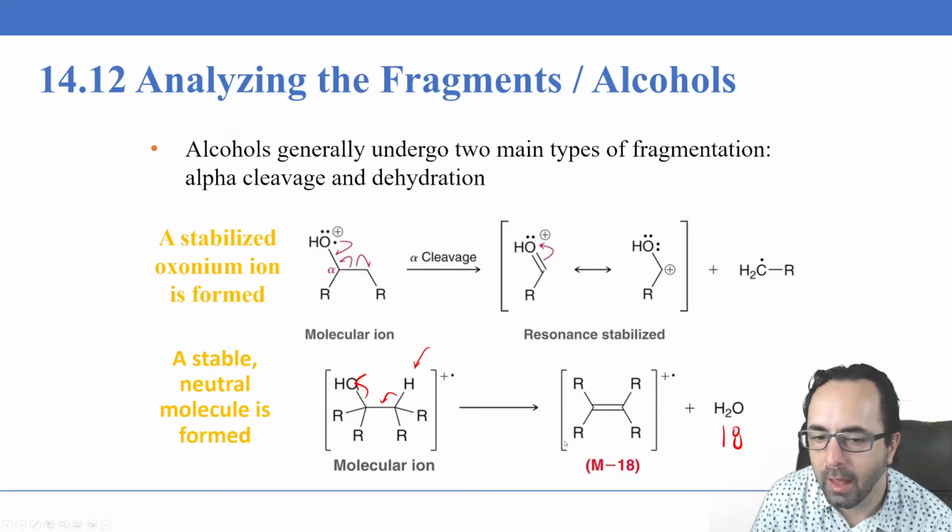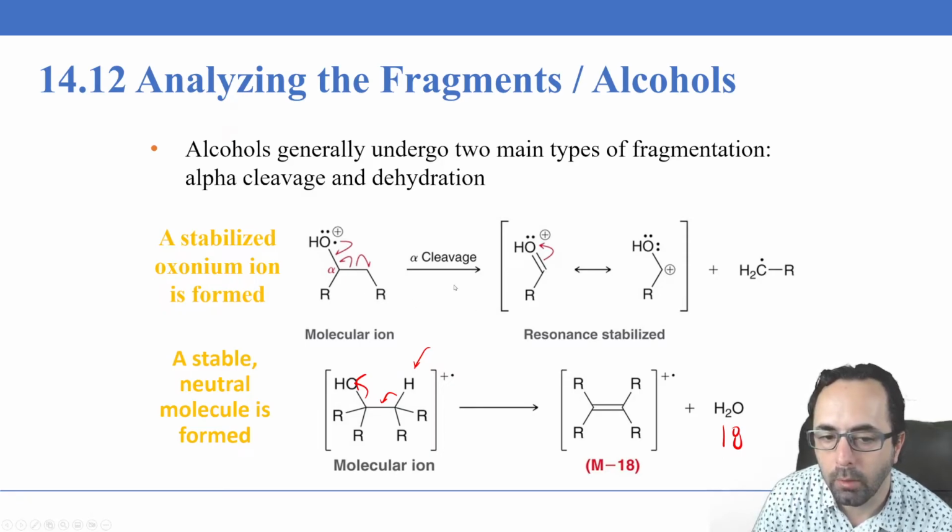And so if you spot that, you should also look for the evidence of a nice and strong peak that results in the alpha cleavage here of the alcohol. And that will be your confirmation of the alcohol. You should see both of these things happen.